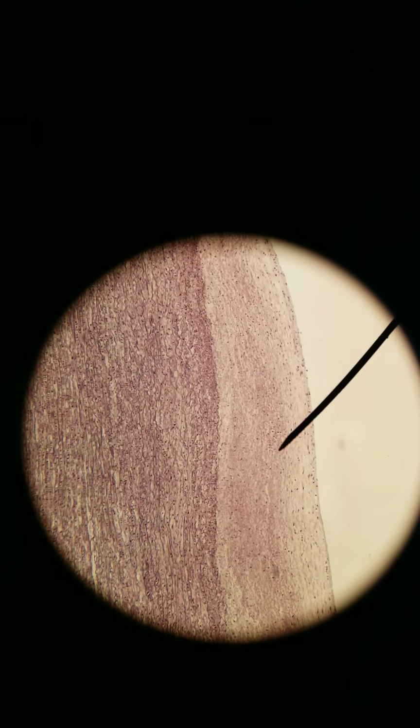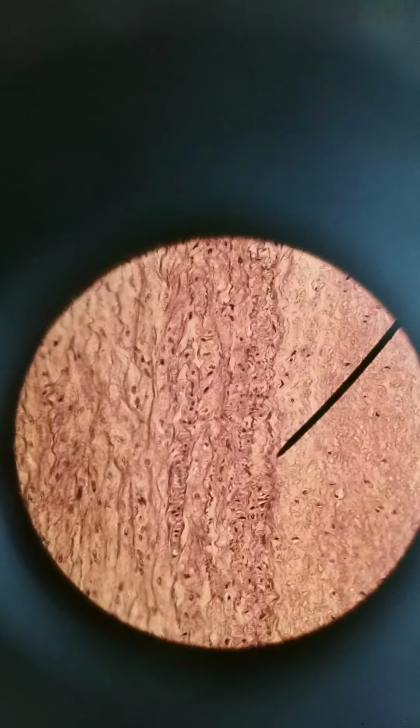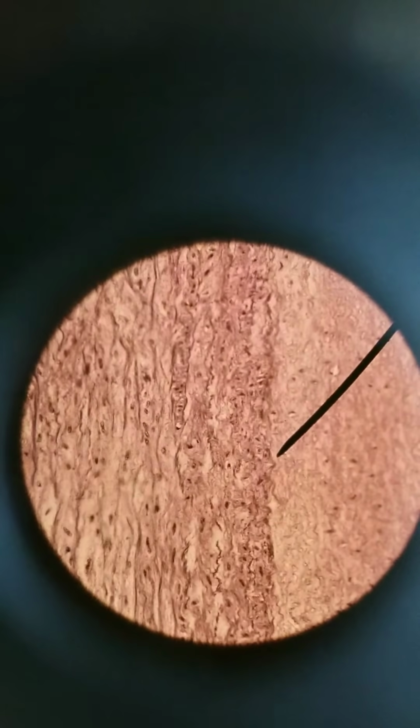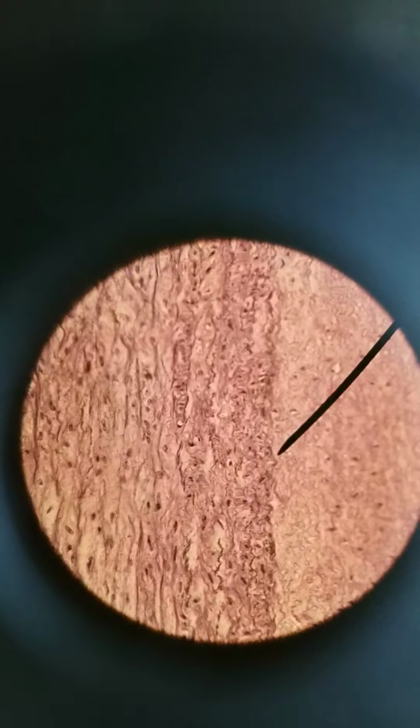I'm going to zoom back out again because it'll help us see the borders. This border right here where it starts to get squiggly and dark, that's the internal elastic membrane. Going back into 400, there's our border. Get in focus, there we go. You can see how squiggly it is. That's the internal elastic membrane, the beginning of tunica media.